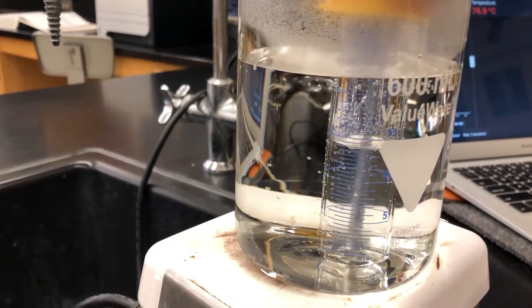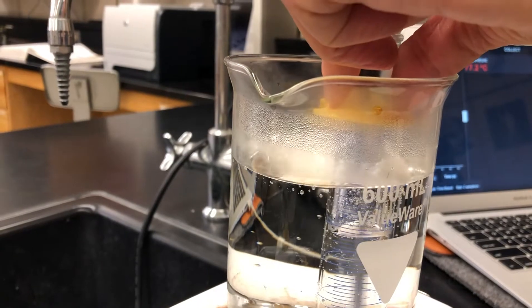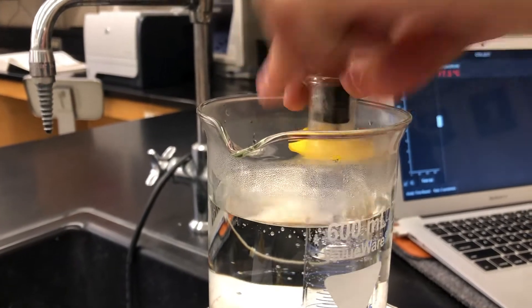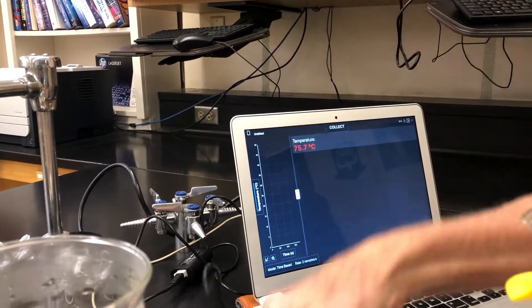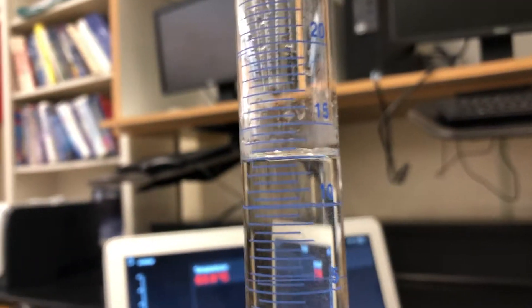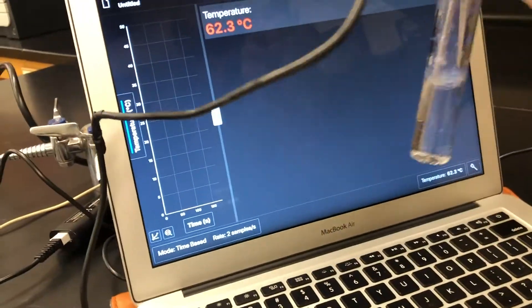We're going to remove the graduated cylinder from the hot water bath and stir continuously while letting it cool. You're going to determine and record the temperature at which the first crystallization starts occurring — that corresponds to the maximum solubility at that temperature. Remove the temperature probe, dry off the graduated cylinder, and estimate the volume to the tenth of a milliliter. You can pause or rewind the video if needed — you're going to need the total solution volume at this point.